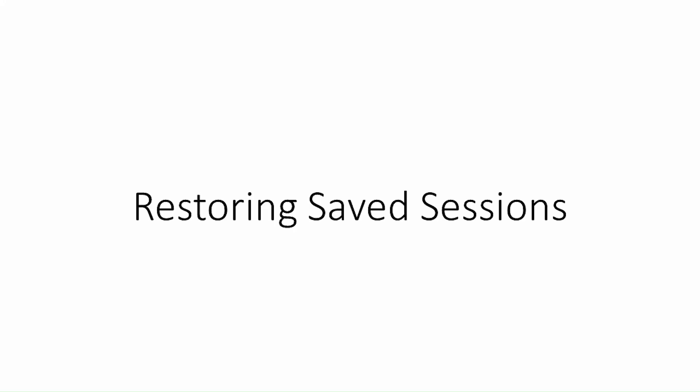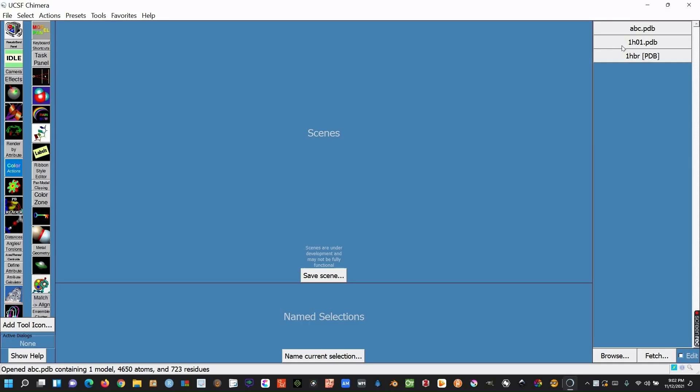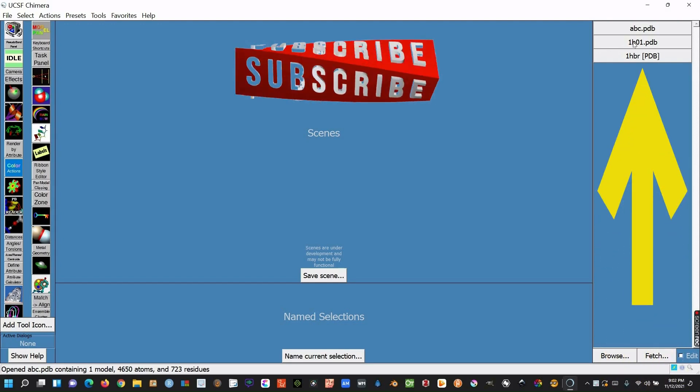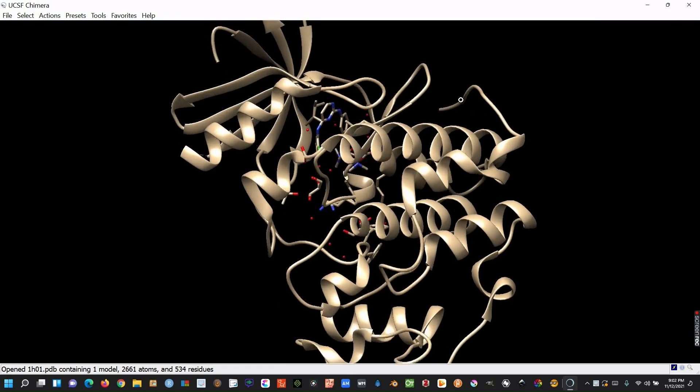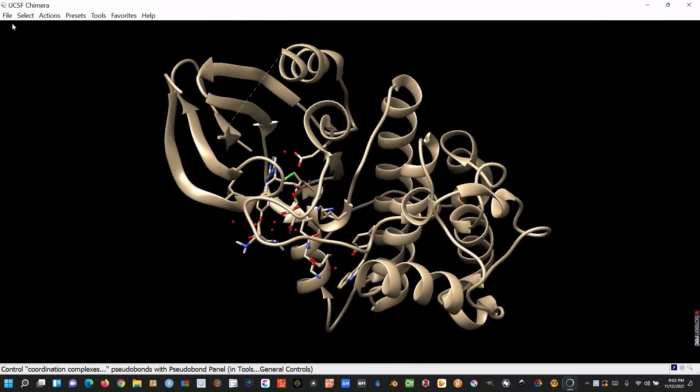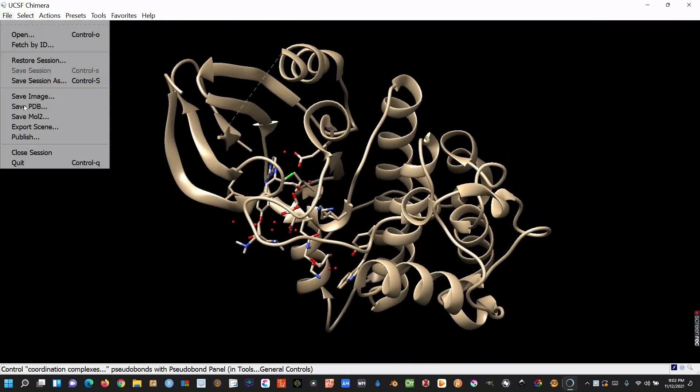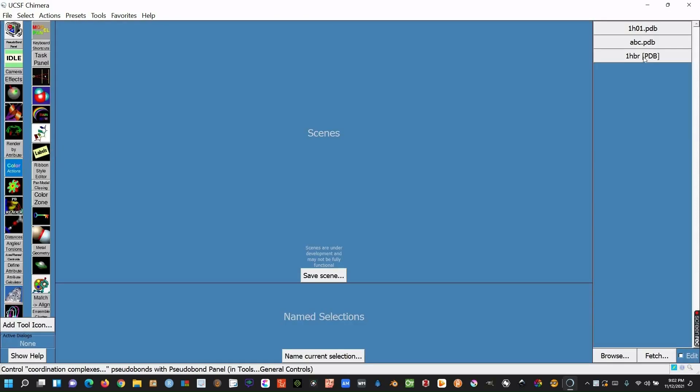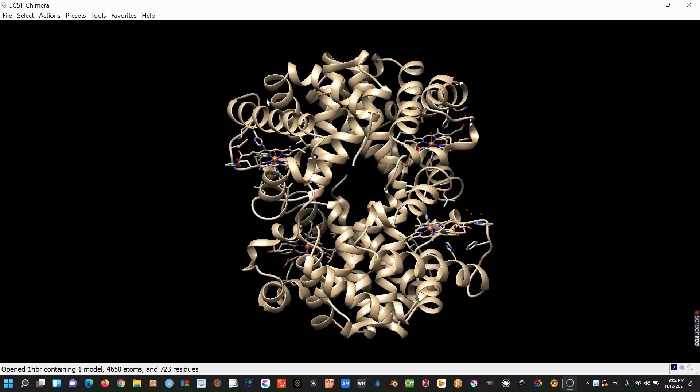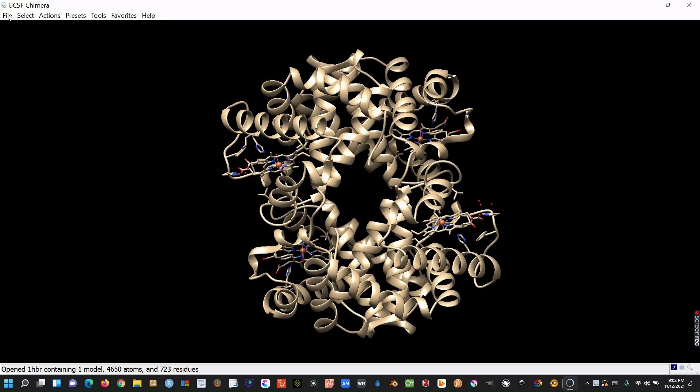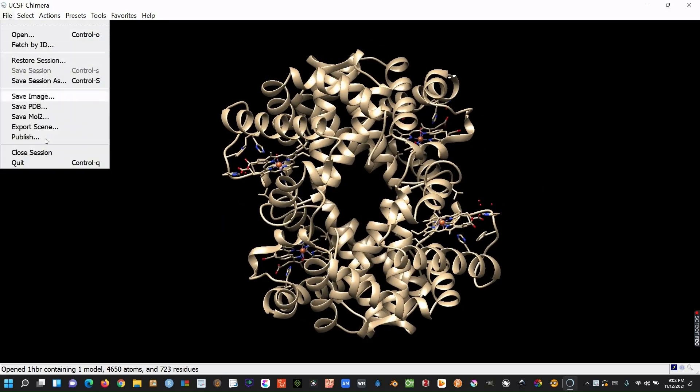Our next objective is to open a recently closed molecule. If you have opened and closed any structures recently, they will appear here. You need just to click on your desired structure. The structure will immediately appear in the scene window. Close this session from this option of the file menu. Now open another structure from the history and then close the session.